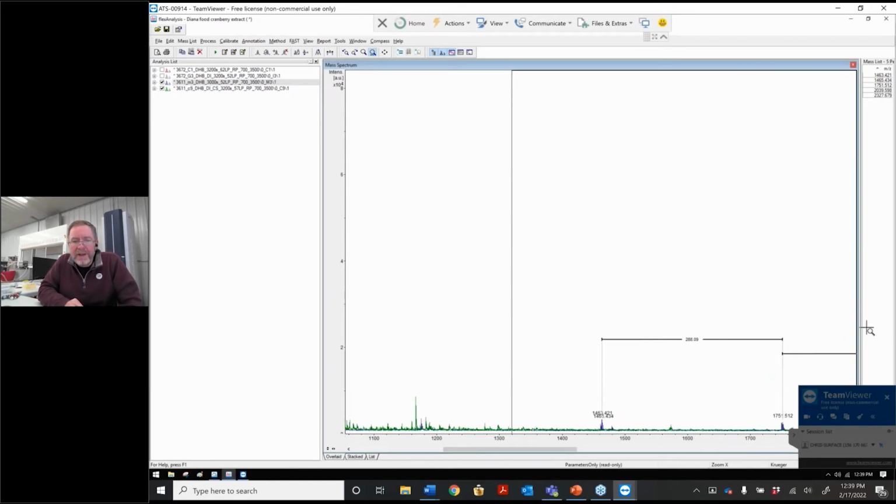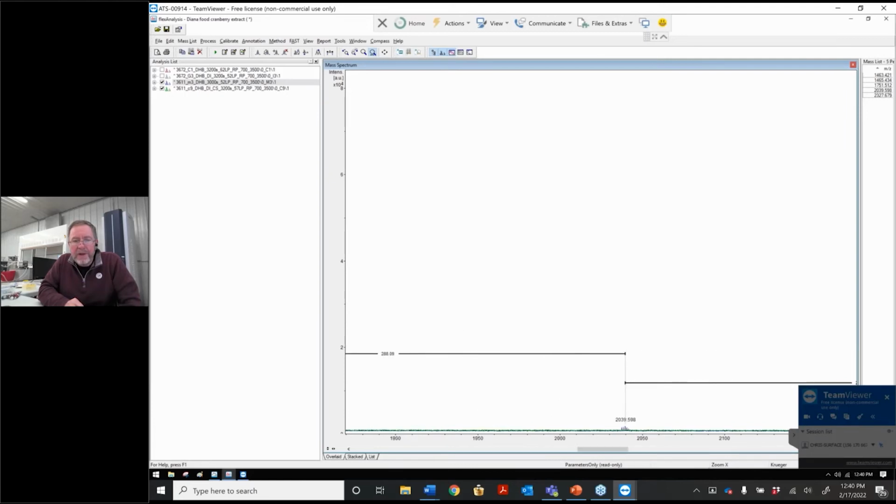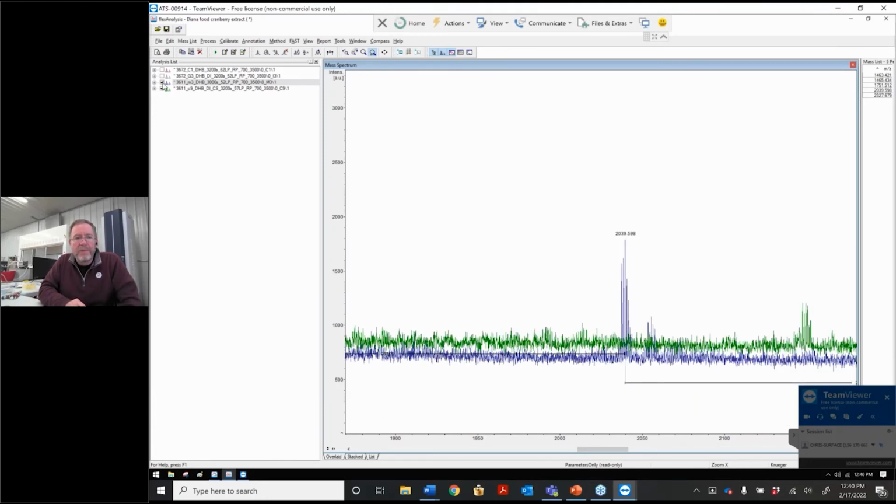Let me see if I can't get a little better example here. Yeah, I think this one might be a little bit better.